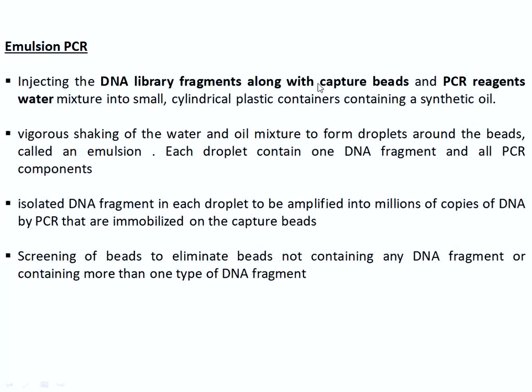For this, the beads along with PCR reagent water are mixed into a small cylindrical plastic tube containing synthetic oil, where vigorous shaking of this PCR water mixture and the oil mixture leads to the formation of a small droplet around the bead, that is called an emulsion. Each droplet contains one DNA fragment and all the PCR components which are mixed in the water.